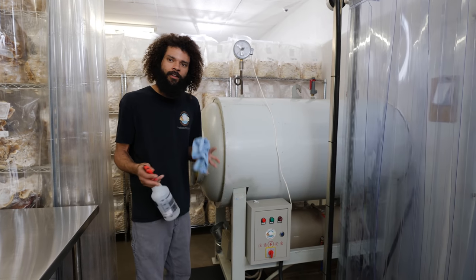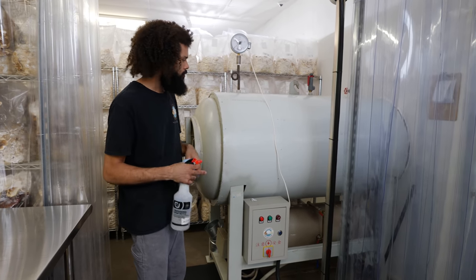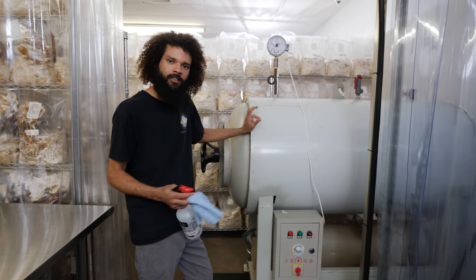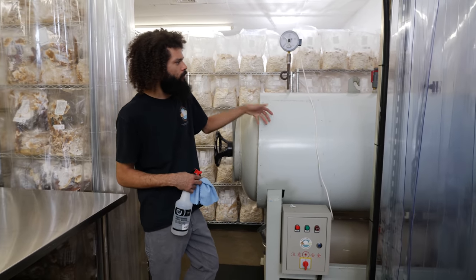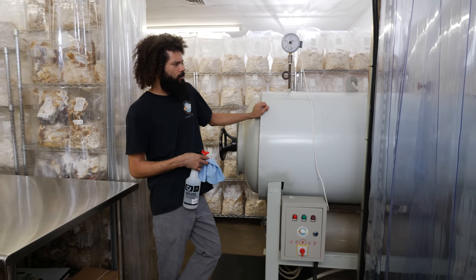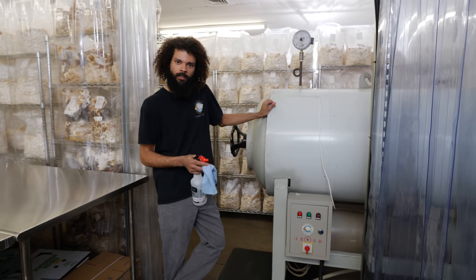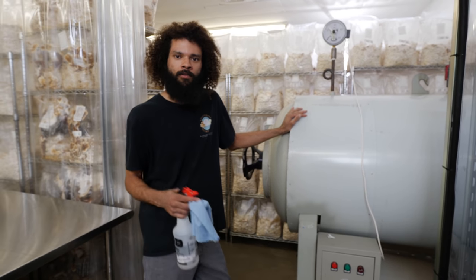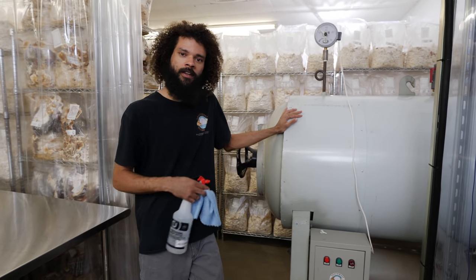Here we are at the autoclave in front of the spawn lab, lab 2, and I have a bunch of spawn in here — grain spawn that has finished the sterilization process. So it's a full autoclave. Now it's time to get it unloaded, get the spawn worked with, and get it ready to move out of the lab so we can go to the next process or project.